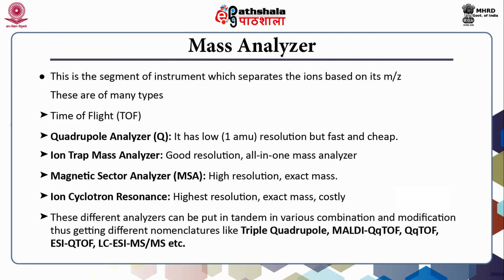These different types of analyzers can also be put in tandem continuously in various combinations and modifications, thus getting different nomenclatures like triple quadrupole, MALDI Q-TOF, Q-Q-TOF, ESI Q-TOF, LC ESI MS/MS, etc.